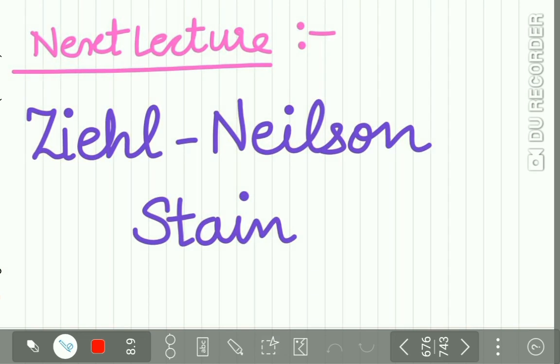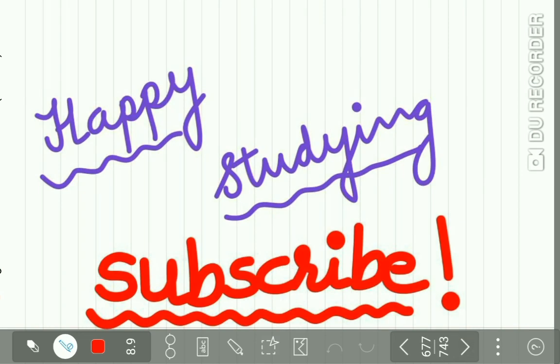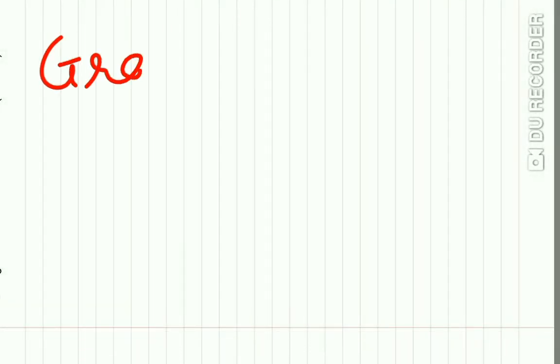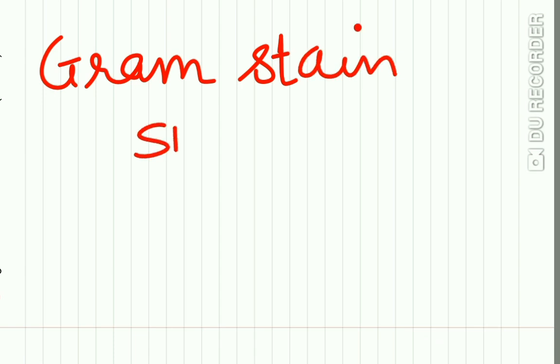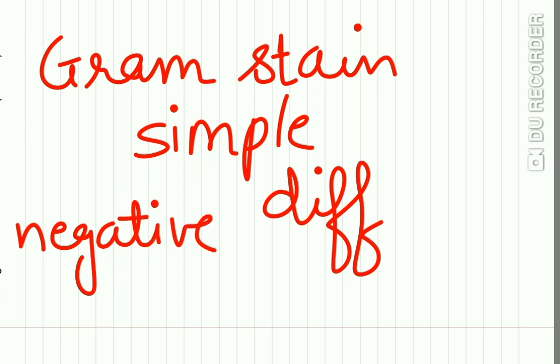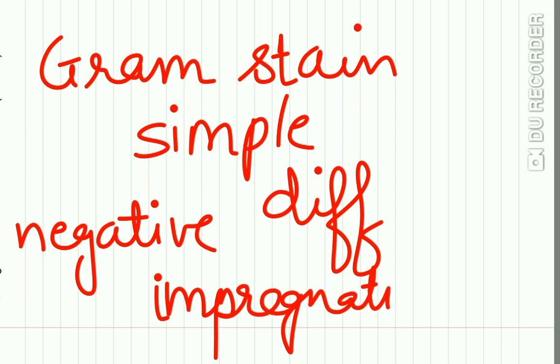The next lecture will be on Ziehl-Neelsen stain. So a question for you today is, what kind of stain is gram stain? Is it a simple stain, or is it a differential stain, or is it a negative stain, or is it an impregnation stain? Let me know how much you have understood from this lecture. Leave your answer in the comment box below.